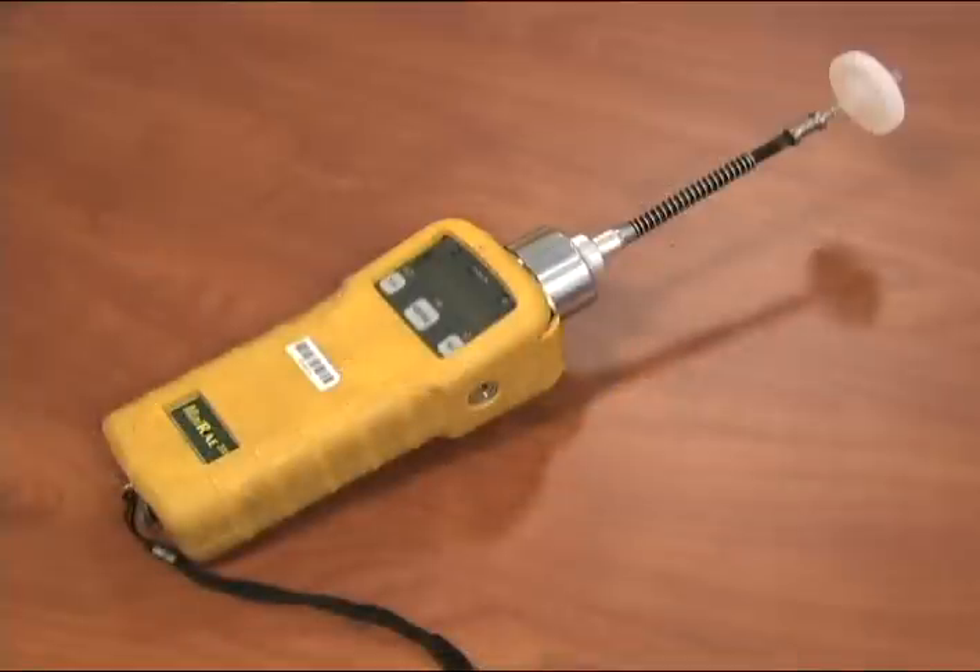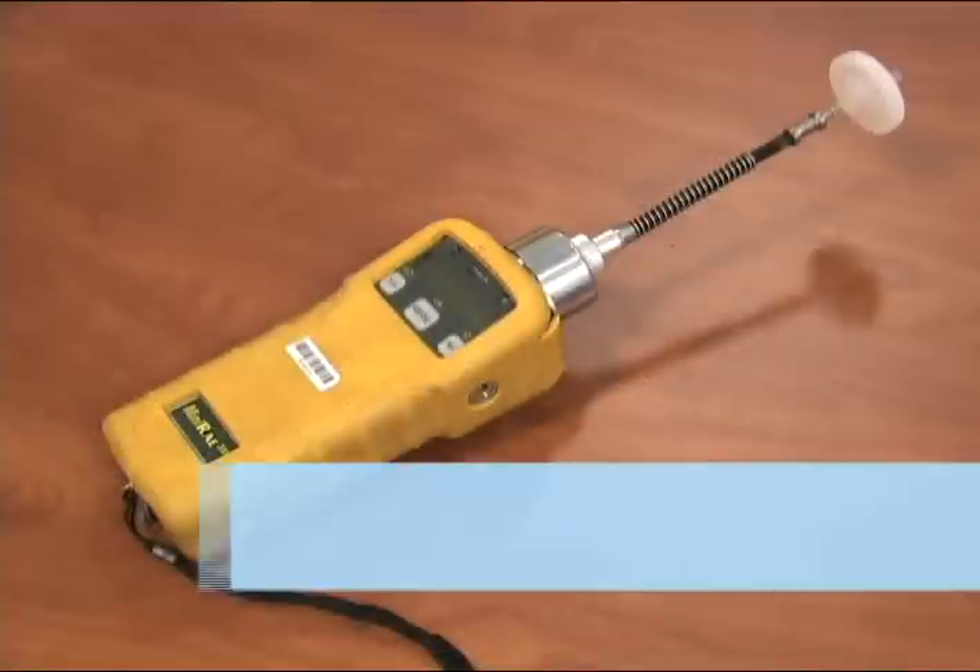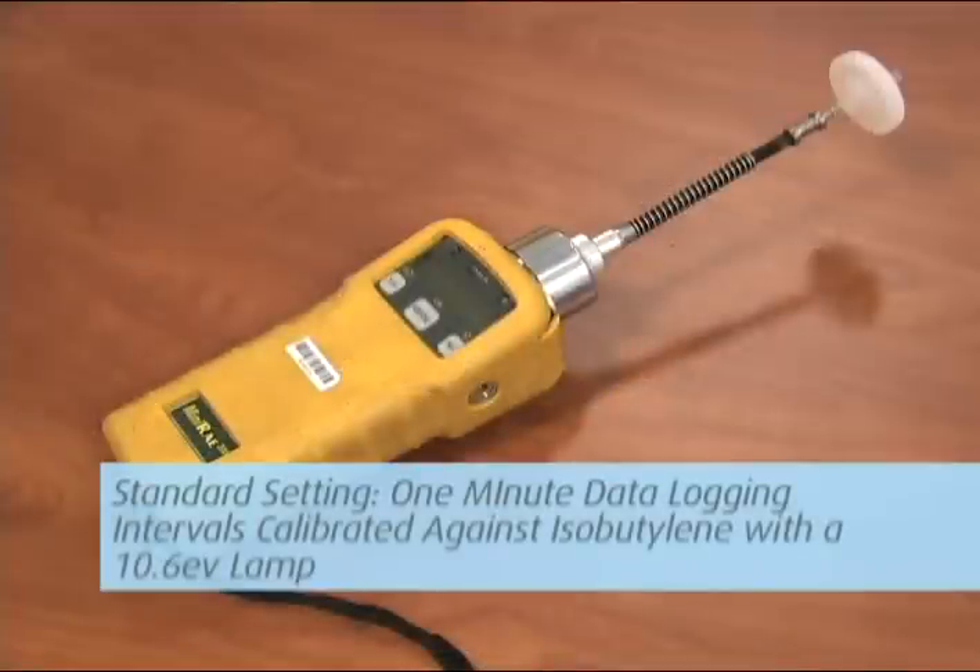Galson Laboratories will preset the unit to your custom settings or a standard setting of one-minute data logging intervals, calibrated against isobutylene with a 10.6 eV lamp.